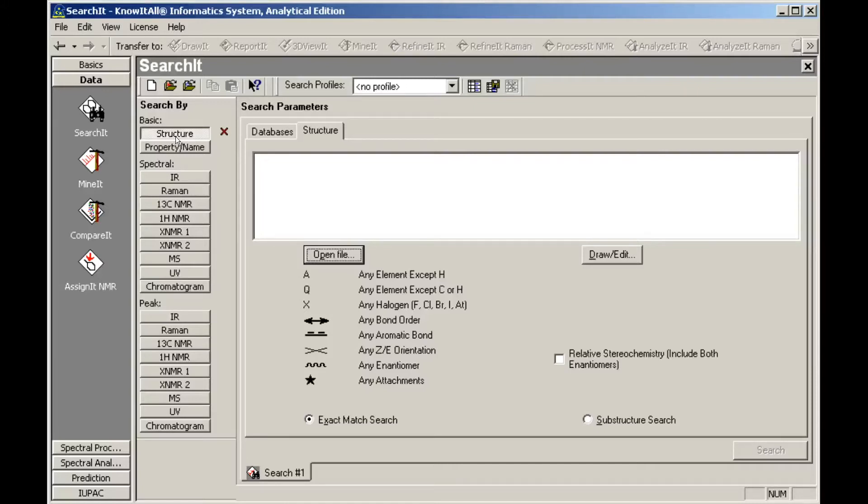There are two ways to define the search structure: either by opening an existing structure file, or by drawing or editing a structure using the Know-It-All Draw It application.